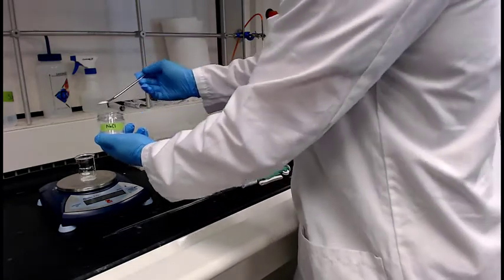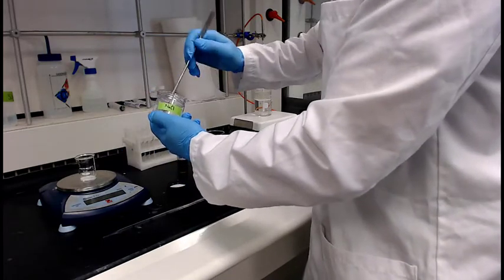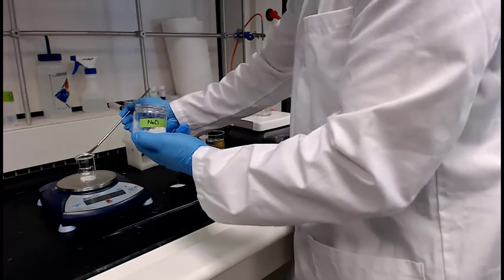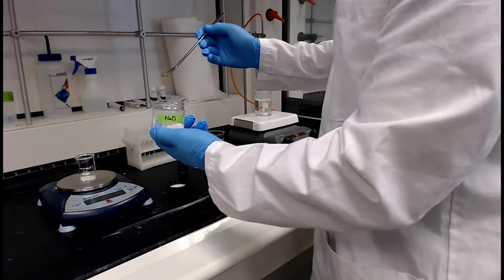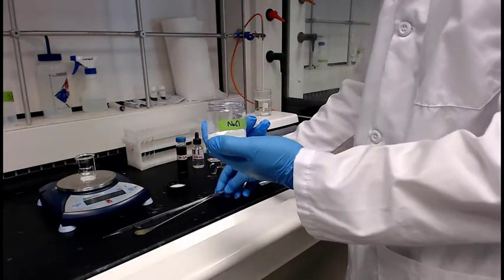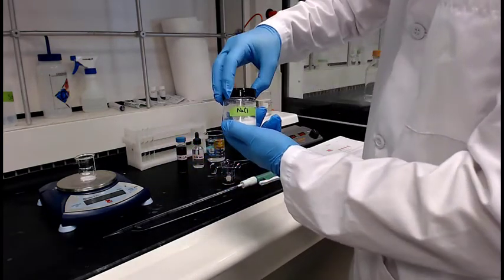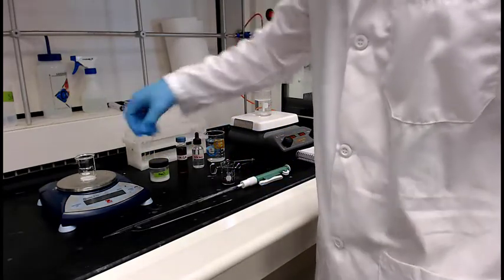Again, this doesn't have to be exact, so if it's 1.1 or 0.9, that's going to be probably close enough. What we're trying to do is set up an equilibrium where we get it just right so we can play with it a little bit, move it back and forth from left to right. So that's why we have to set these up this way live.